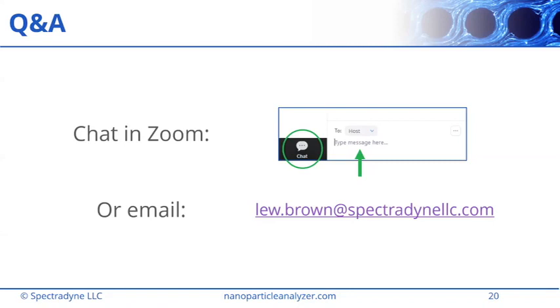Ones that have worked really well for us, one specifically is tangential flow filtration methods, or TFF, in which the EVs, it's very gentle. They just pass through a cycled tubing system where they go through a filter, and then there's pores in that filter, and small protein aggregates and things smaller than EVs can pass out, and it'll basically concentrate your EVs over time, but it's very gentle on EVs, and that's one that we found works very well.